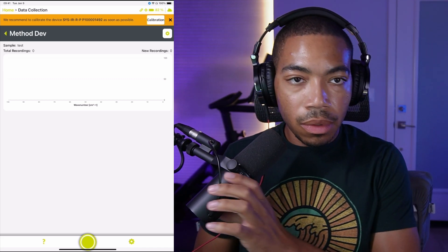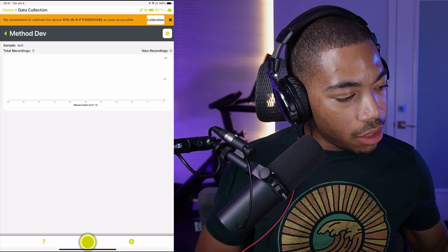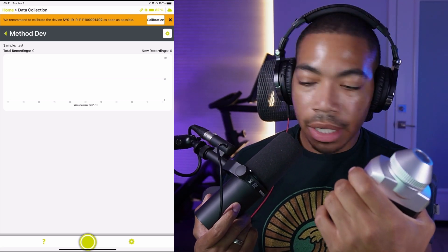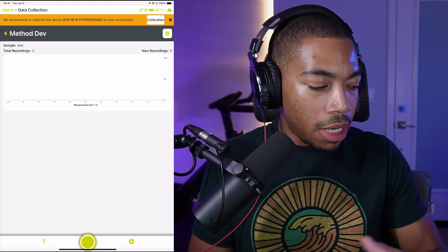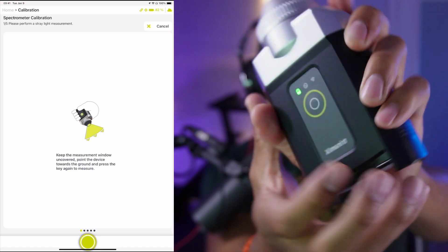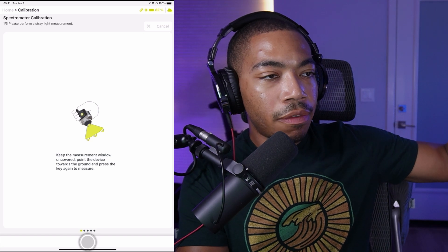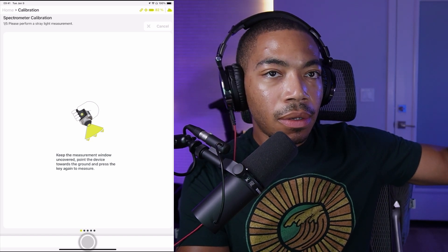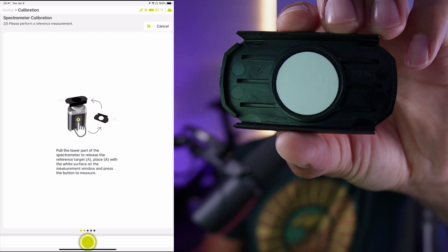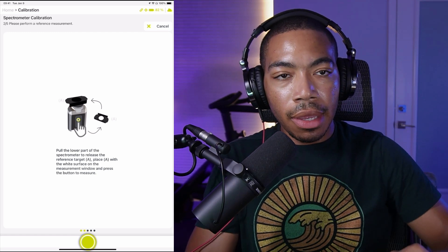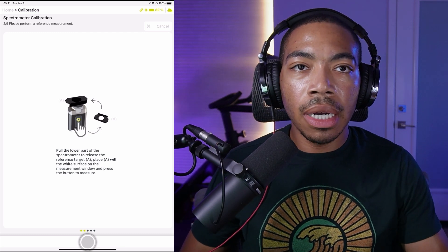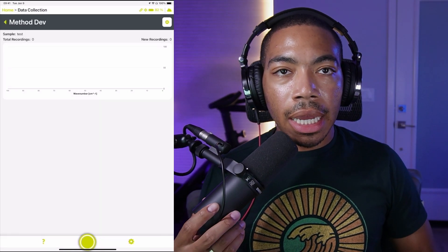Let's switch the camera — it appears I need to calibrate the instrument. I've had this instrument on for a while and it sends a reminder to calibrate before running more samples. The calibration is really simple: I push this button and point it away from me — you might see a flash. Then I place this white surface on top of the device and push the sampling button again.